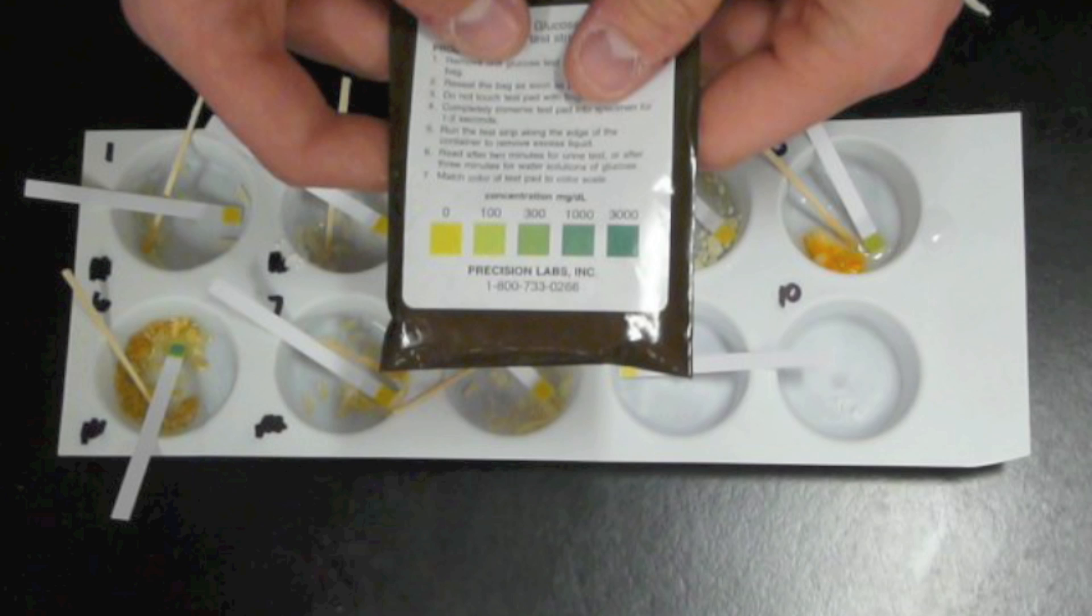This bag shows us a chart that can help us figure out how much glucose is in each one of these foods. Let's look at our positive results and see if we can figure it out.